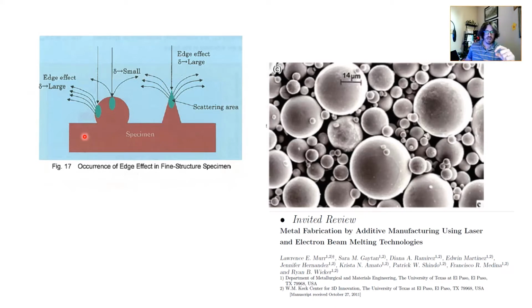And the position of a secondary electron, if you remember, is traditionally at the side, right? So you get these secondary electrons coming out of the side of the surface. And so you'll get that electron signal plus the electron signal from the top going over there. That's what this image is trying to depict. So you have a higher intensity, and that is called edge effect.